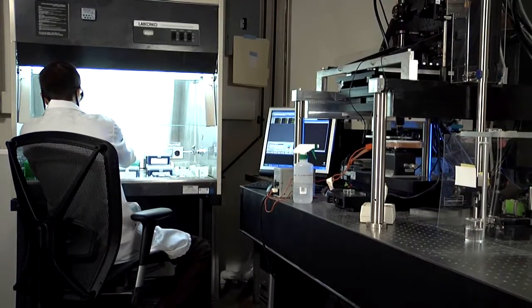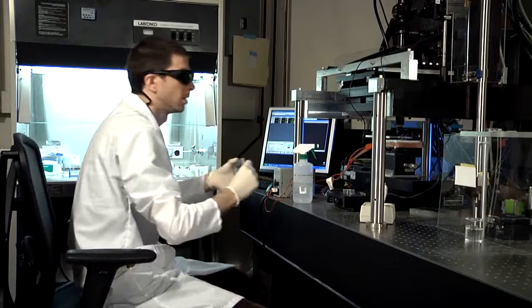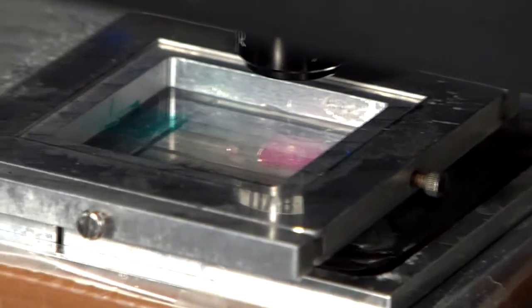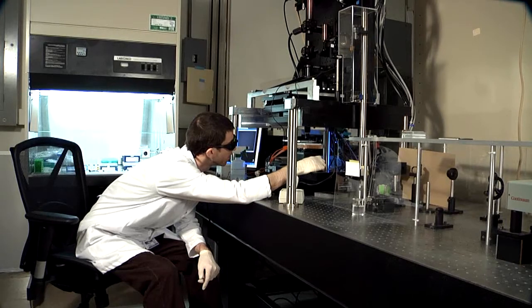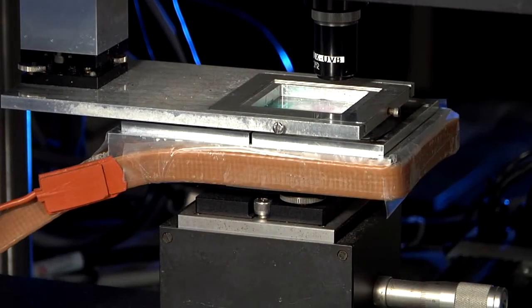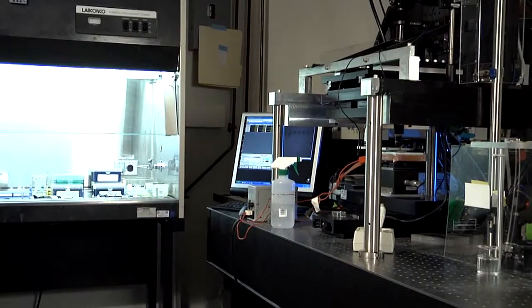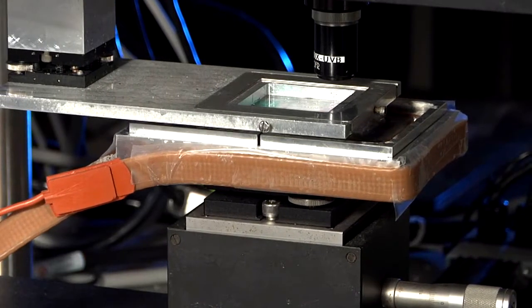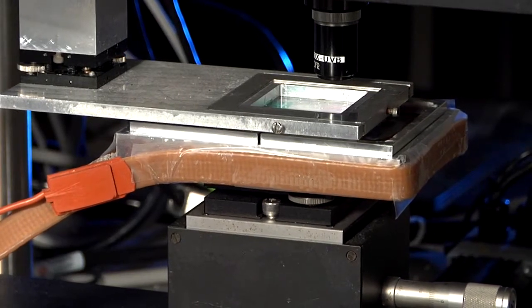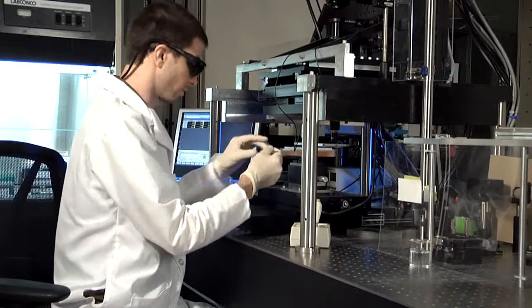We then micro pipette the cell suspension onto the Corx ribbon, and then slide it into this mount which is connected to the top set of XY stages and make sure that the distance between the paper and the printing ribbon is about a millimeter. Make sure that we have ribbon to print from. That's it — so that is printed. It starts to find structure onto the paper.